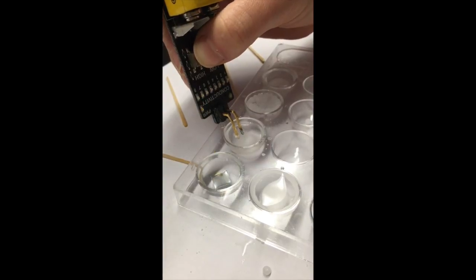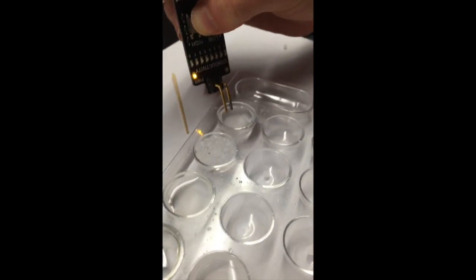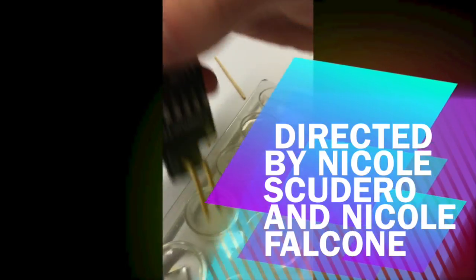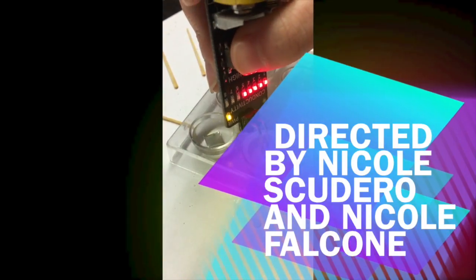And the sucrose is not a conductor either. The table salt can conduct electricity in water, as you can see. And the potassium iodide as well can conduct electricity in water due to its ionic compound bonding.